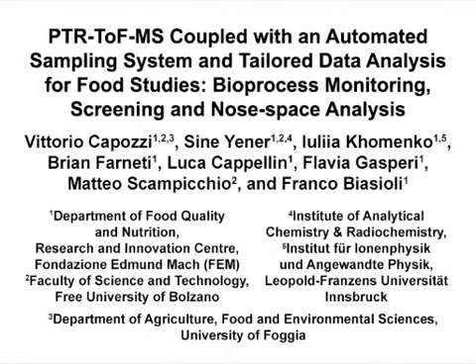The overall goal of this paper is to demonstrate the potential of PTR-ToF-MS for direct volatile organic compound analysis in food science and technology, and in particular, the importance of automated sampling and tailored data analysis.